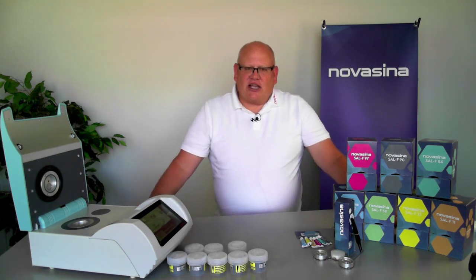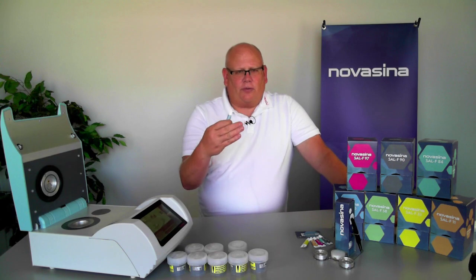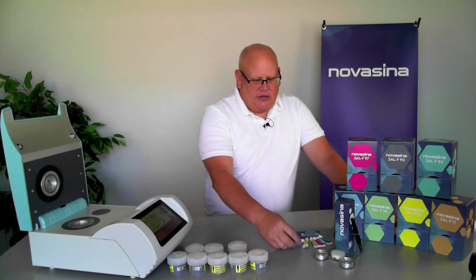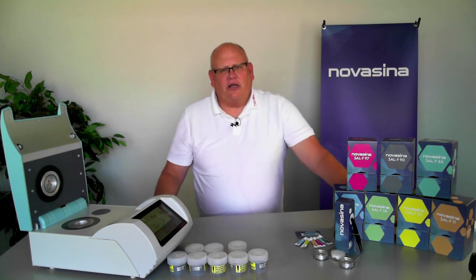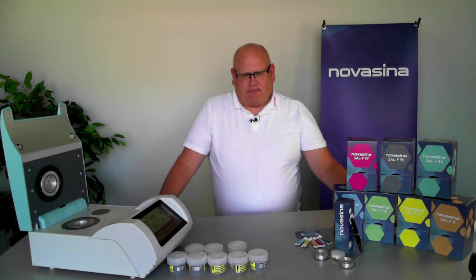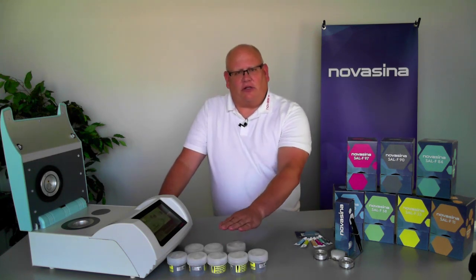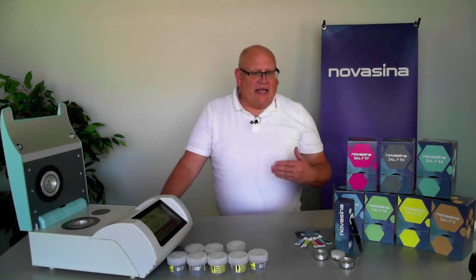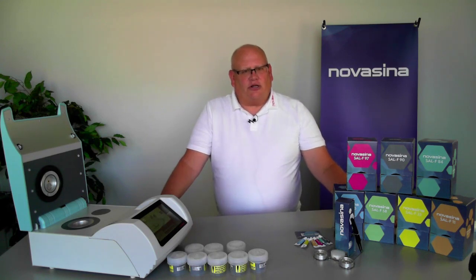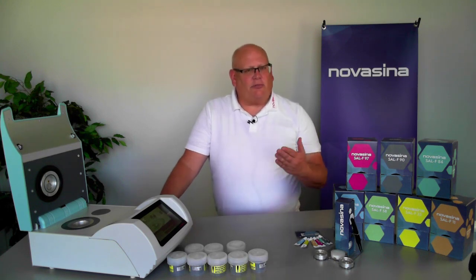Alternatively, we have the unsaturated salt standards, which come in single-use vials — these are called SAL-F standards and are a one-time use consumable. You empty the contents, take a reading, and if you need another reading you need a new vial. However, they run very quickly — as opposed to the 20 to 30 minute read time for the SAL-T standards, the SAL-F standards run in four to five minutes. So you get results much faster, but you have to continually resupply those standards.